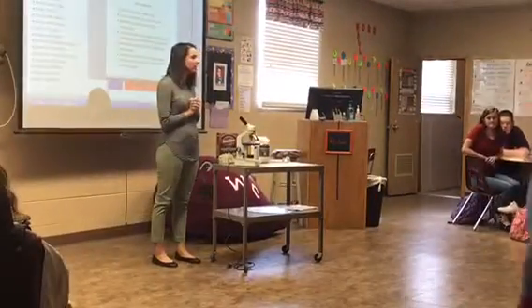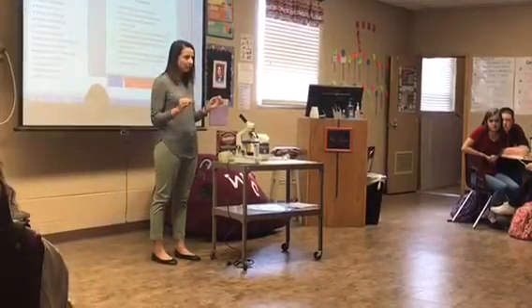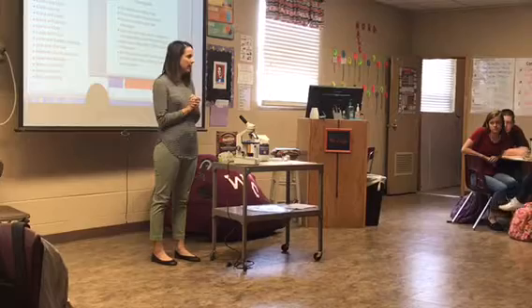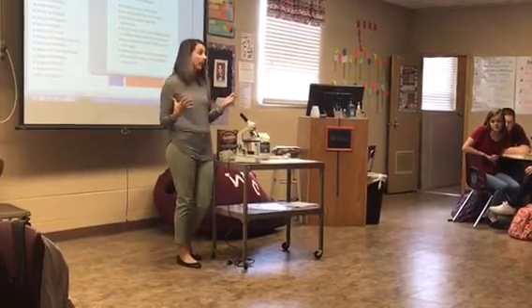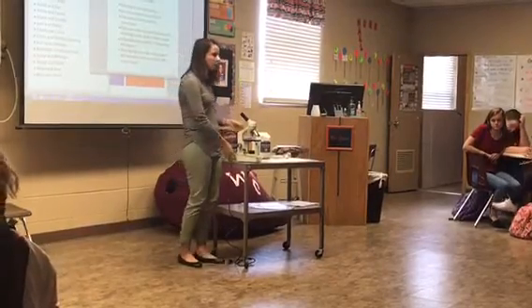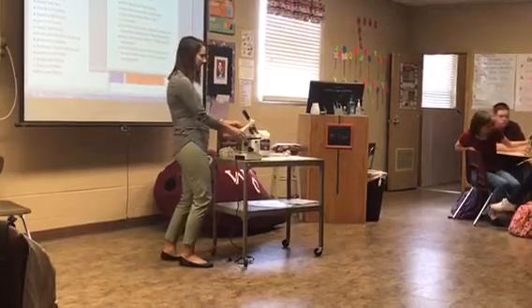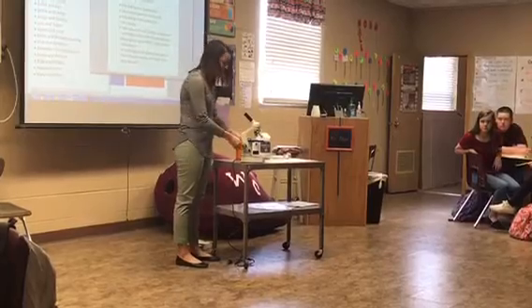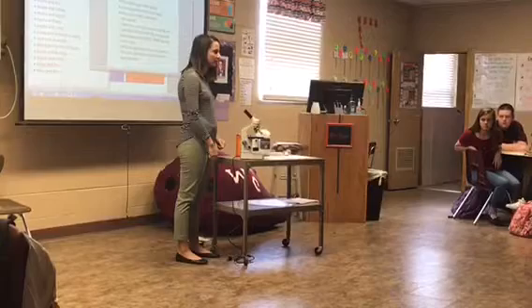So the first thing we're going to talk about, before we start, is how to properly use a microscope. I know I have all of you in integrated A and B, so you should know how to use it, because we've used it a couple times. But just to go over it, make sure the arm is facing you, so that when you view it, it's easy to manipulate the adjustment knobs.